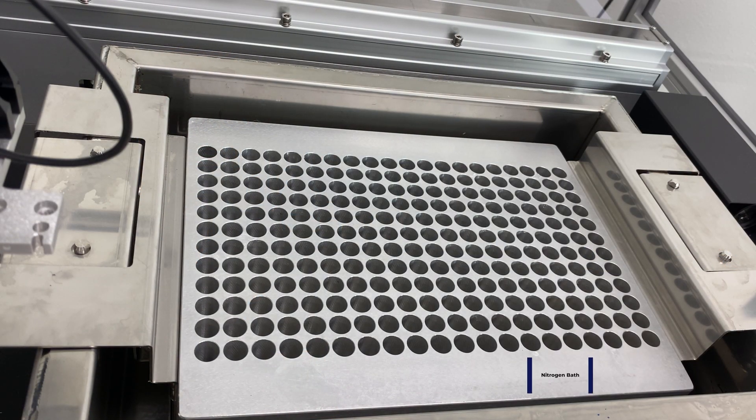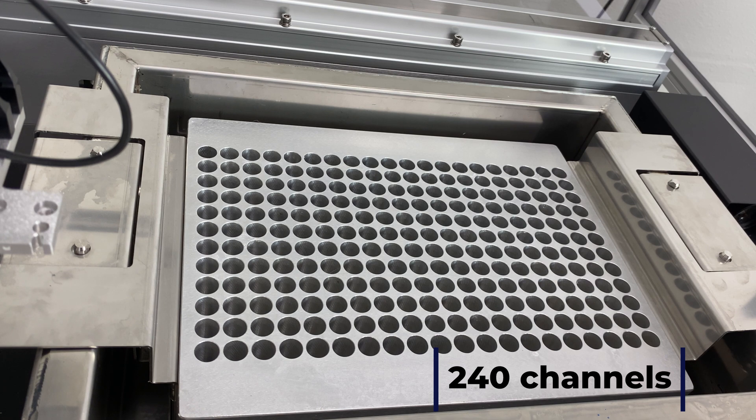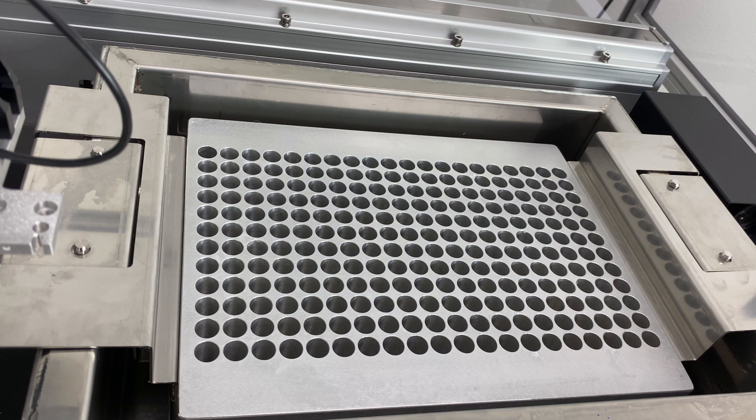Here we have our liquid nitrogen bath. It consists of a partition tray in which there are 240 different channels for the liquid droplets to be dispensed into. After LN2 is first filled into this tray, each of the drops are dispensed into the different channels. The partition tray serves to separate the droplets so that they don't come into contact with each other. Below the partition tray there is a catch tray which captures all of the beads, and this whole system is removable after the lyophilization run is done and can be easily transferred to the lyophilization machine for lyophilization.